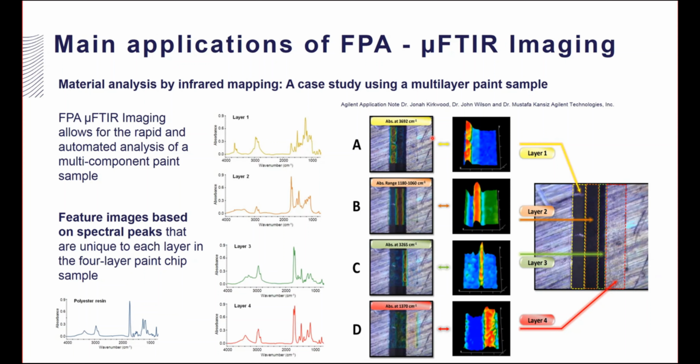And how do we do it? We do it by using the image peaks or the spectral filter I briefly introduced in a previous slide. By highlighting a specific part of the infrared spectrum, we can see the presence of a specific component. You can clearly see that by changing the part of the spectrum we highlight, we isolate a different layer in this multi-layer. So basically, we can identify 4 layers and distinguish them because they also have a different infrared spectrum.